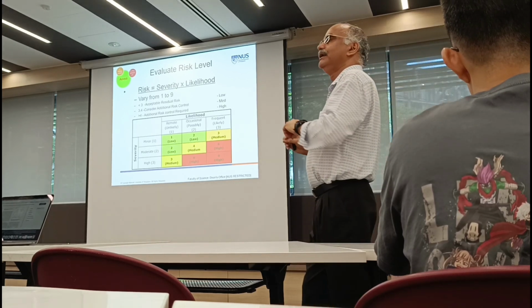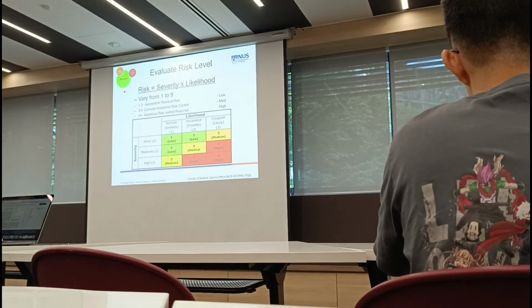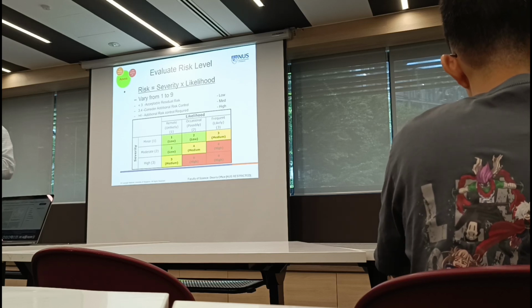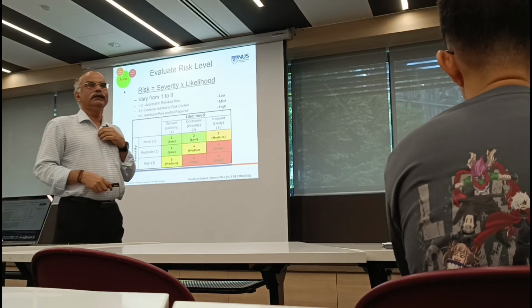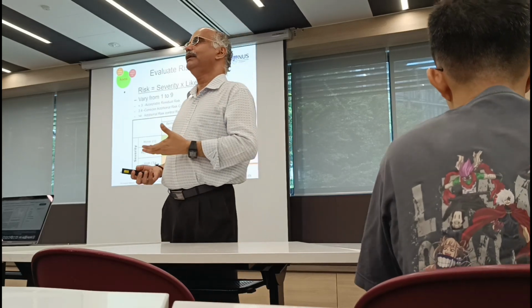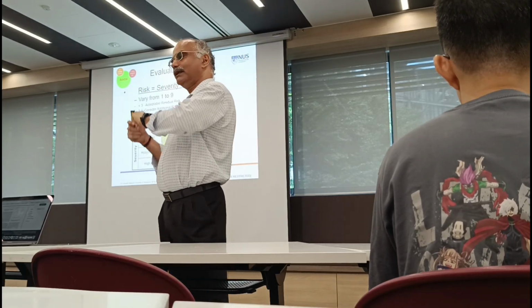So for example, if the first time I'm doing it, I do it on a 1 liter scale, that is already high risk. So how do I bring it down? I do it on a 10 ml scale. Then I can actually bring the score down, right? If I am using lithium aluminum hydride, which is extremely flammable, I can use a 60% solution, or I use a very small amount, and bring it down again.